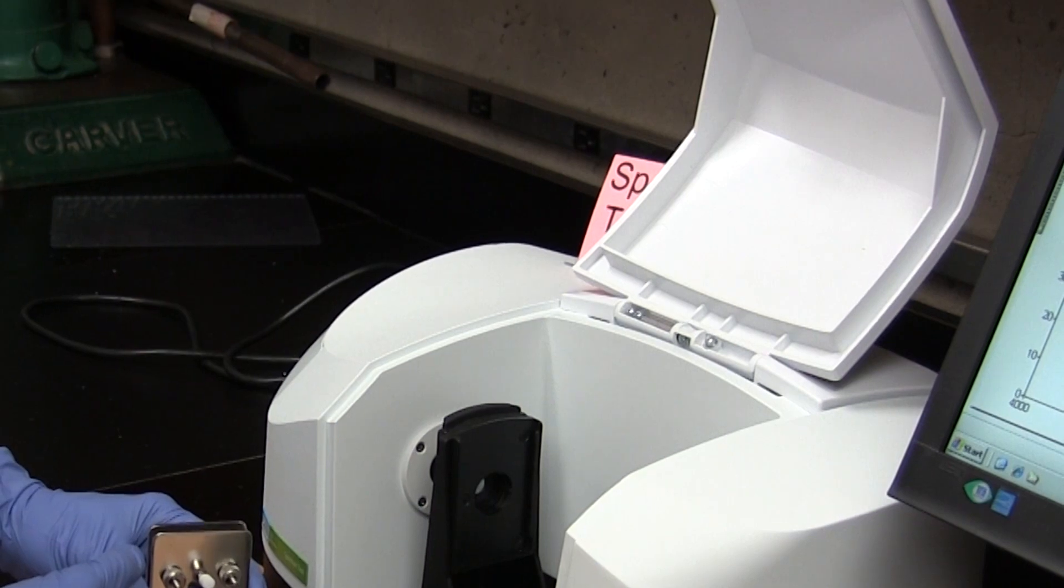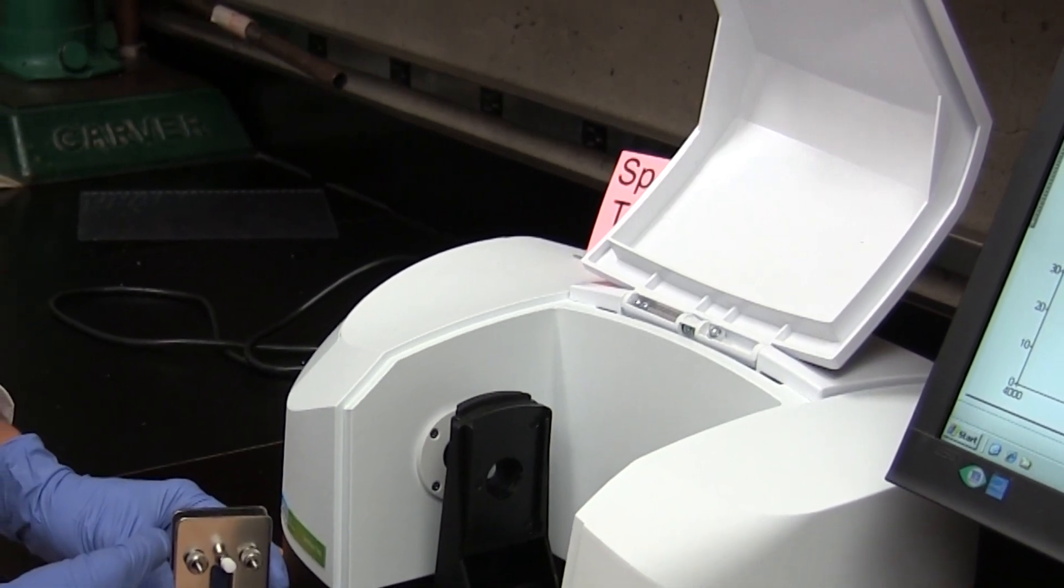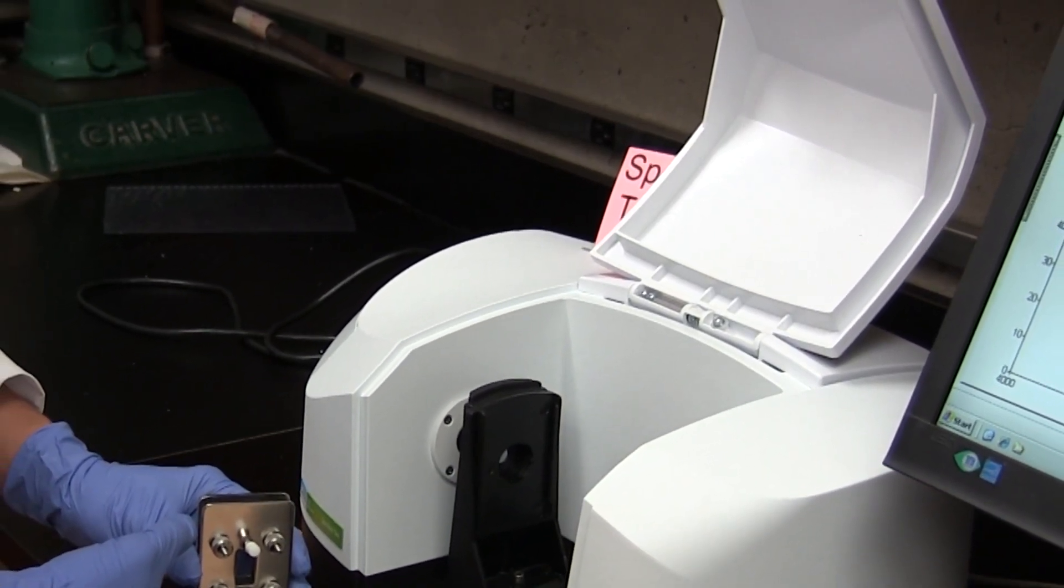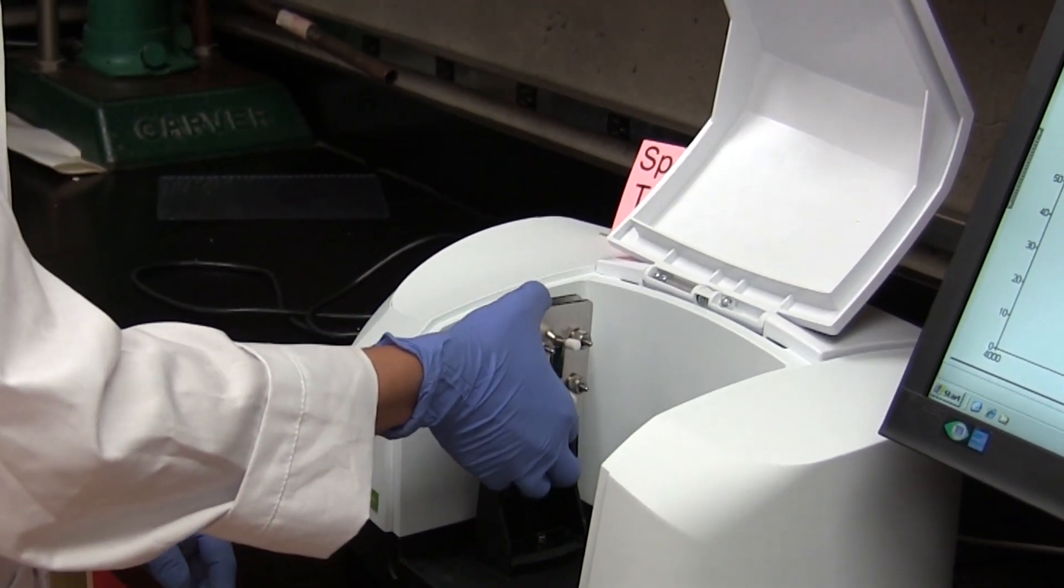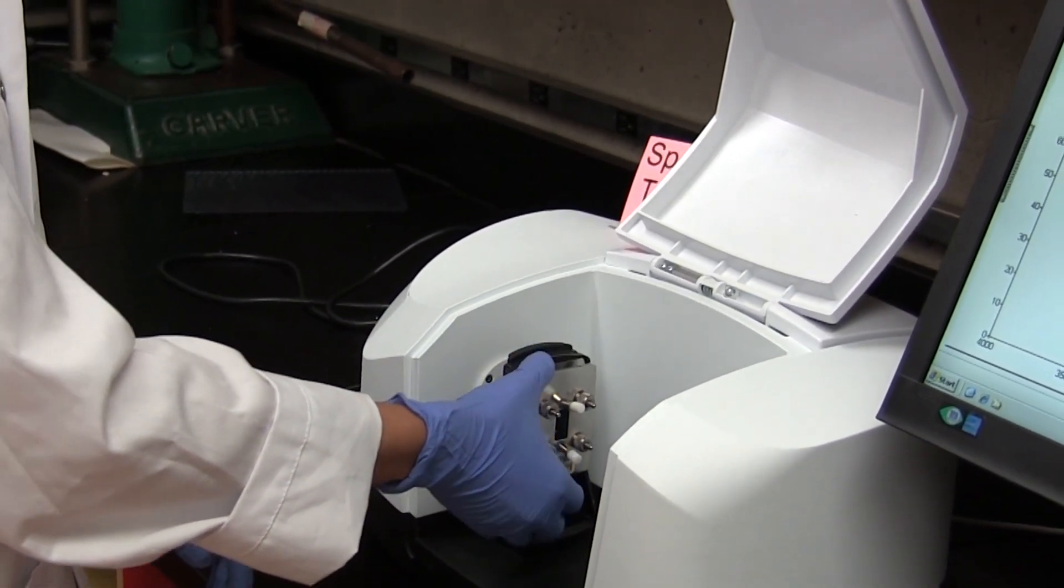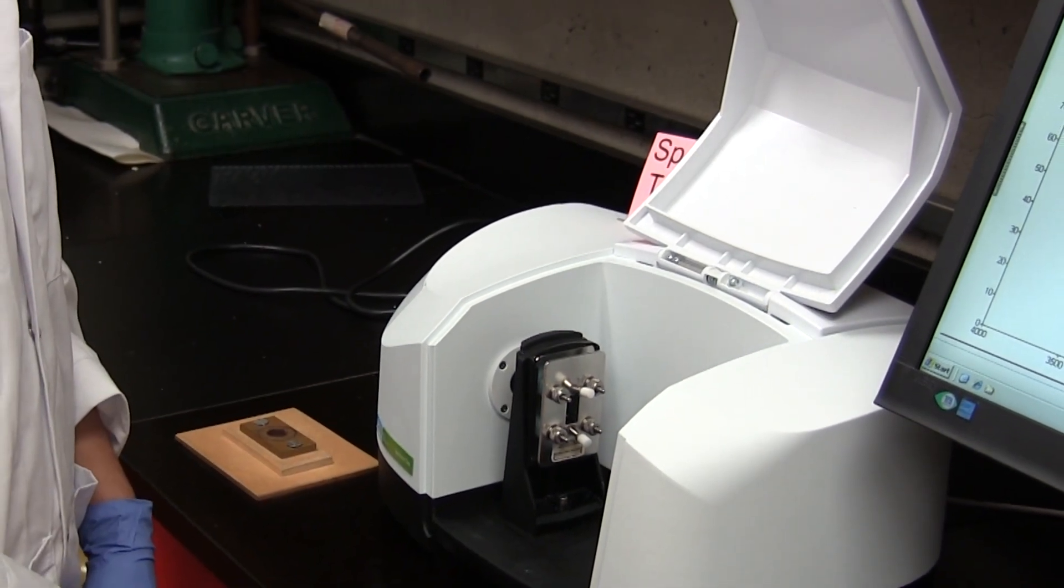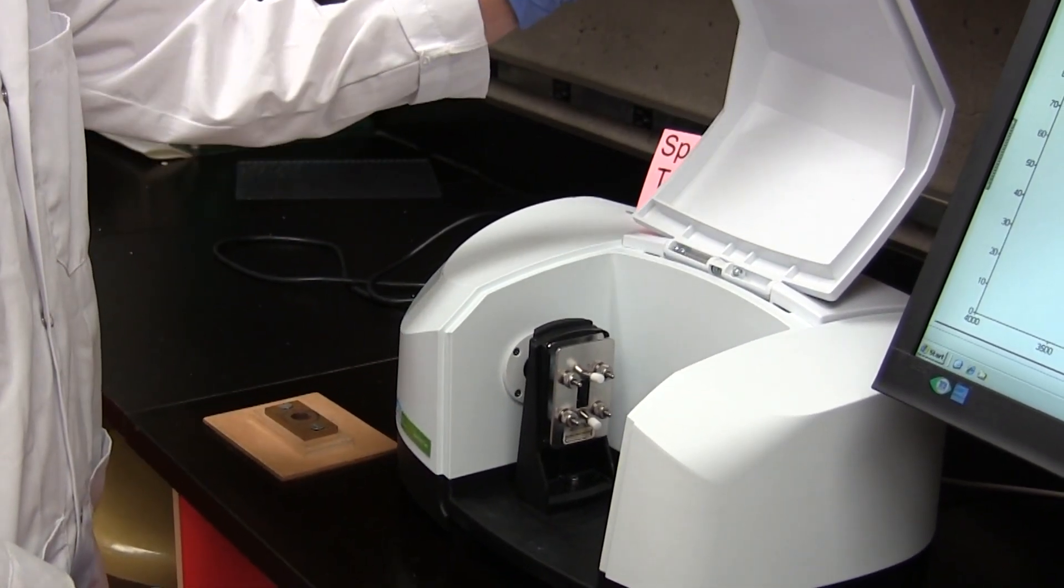A very small amount of the liquid is held between two sodium chloride plates within a demountable cell, and the cell is placed in position inside the sample compartment. This allows a sample to be positioned so that the IR beam can be directed towards it.